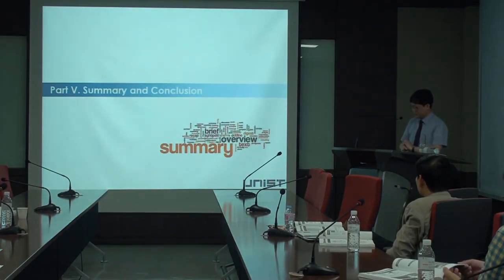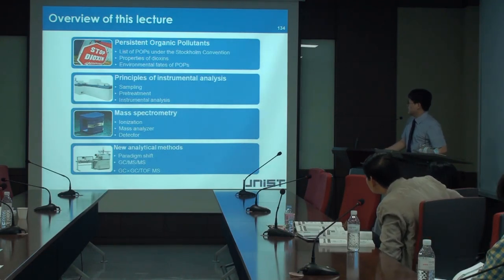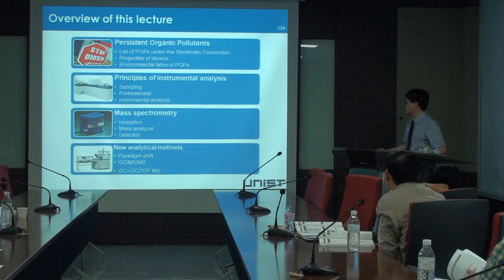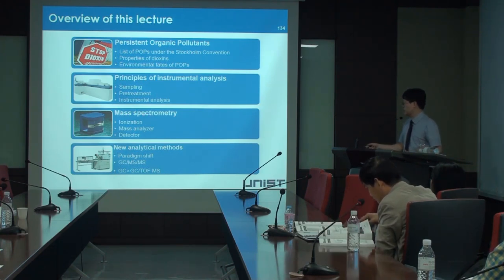Okay, this is the end. Summary and conclusions. For the first part, I introduced POPs, structural classification of POPs, and their properties. In the second part, I explained overall sampling, pretreatment, extraction and cleanup, and useful processes. And in the third part, I explained principles of mass spectrometry.